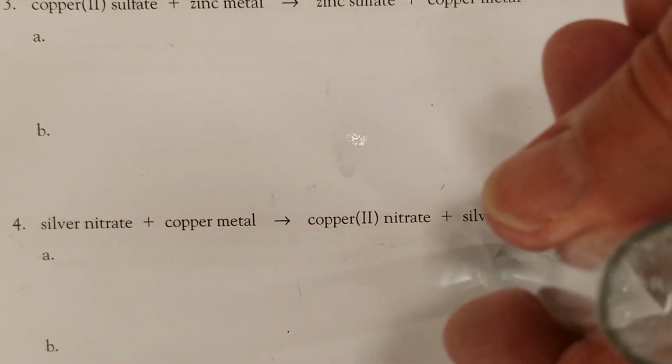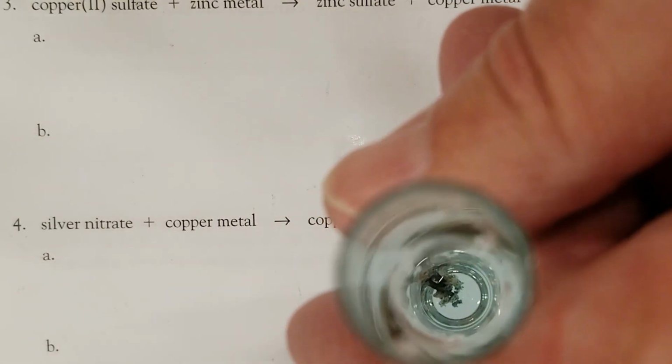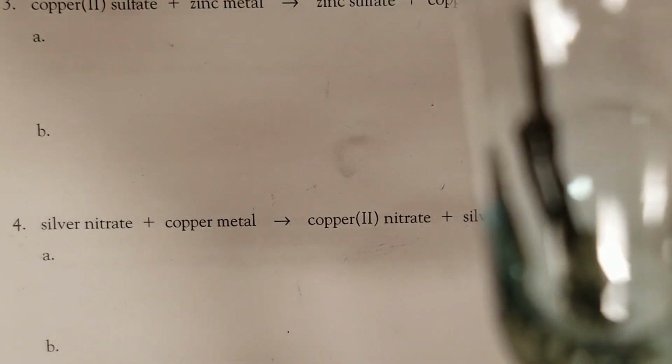You may or may not be able to get a good view of that, but maybe you can see some of the silver metal down there. Let's try and focus. See some of that grayish material. That gray material there is the silver metal.